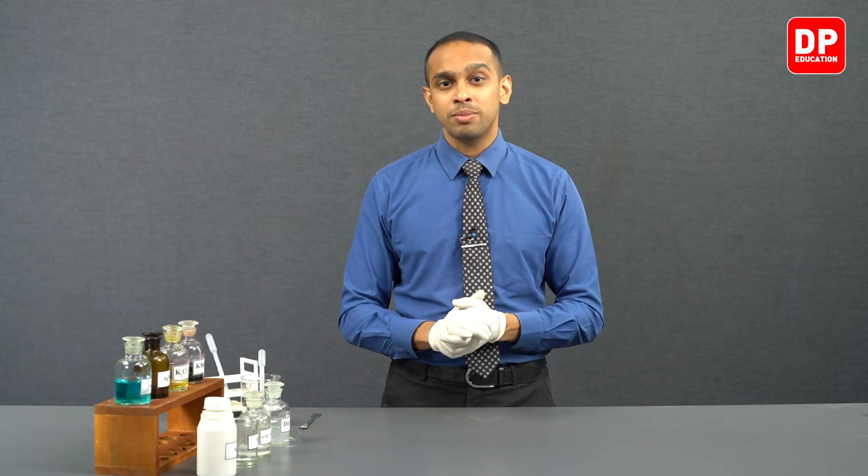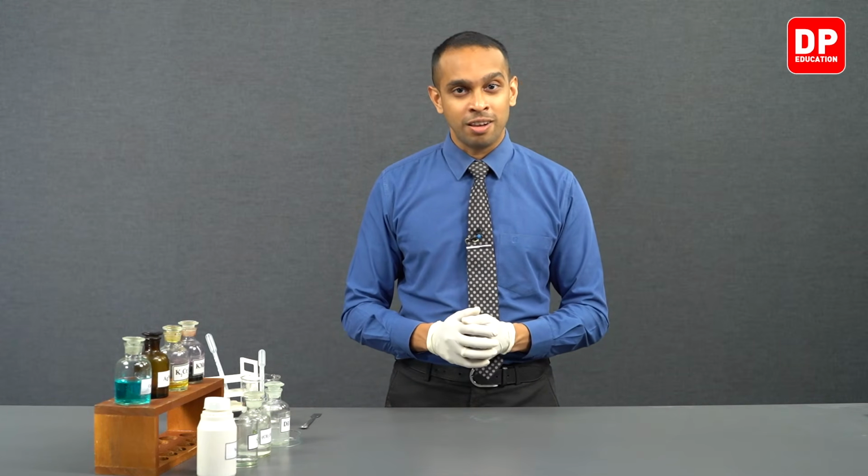The solution becomes cloudy due to the formation of colloidal sulfur as hydrogen sulfide gets oxidized to form sulfur. And as this reaction takes place, we observed that orange dichromate ions turn into chromium 3+ aqueous ions, which happen to have a green color.